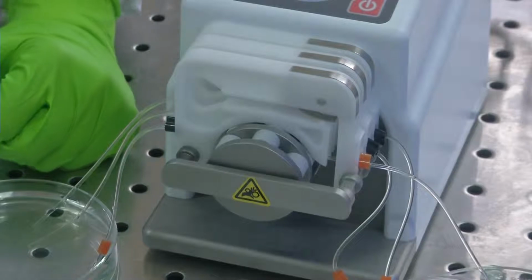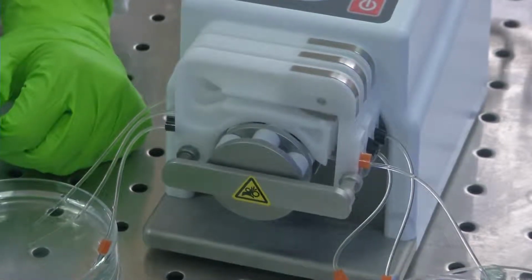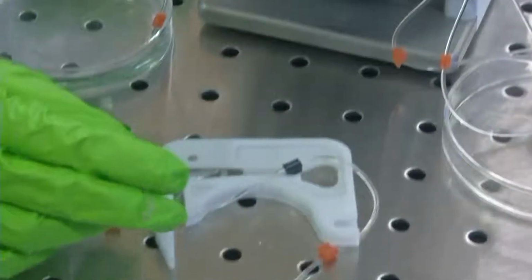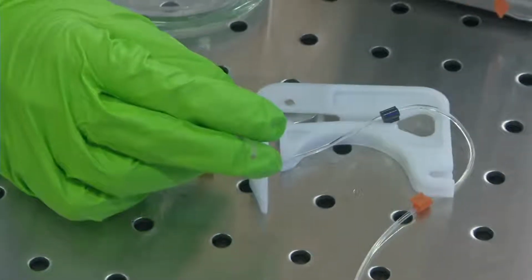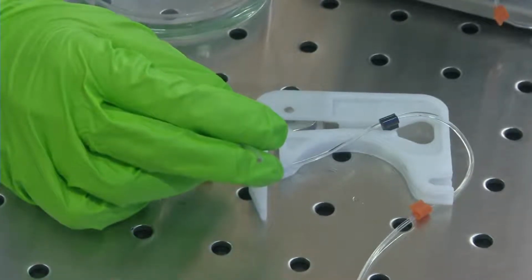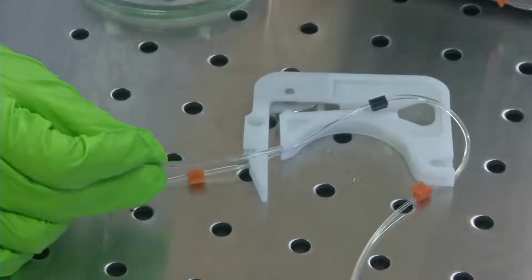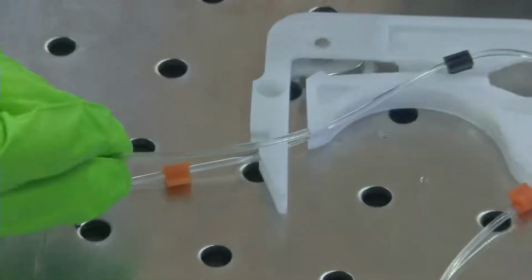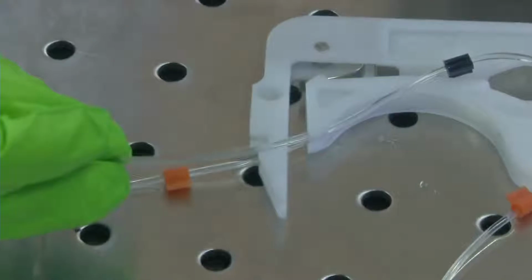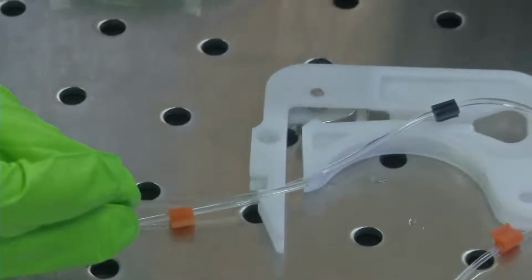Let's look at the diameter. As you can see, the silicon tube is 1 mm outer diameter. However, the inner diameter is very small, around 0.12 millimeter. This is like a pinhole, and the fluid flows through this 0.12 mm inner diameter channel.